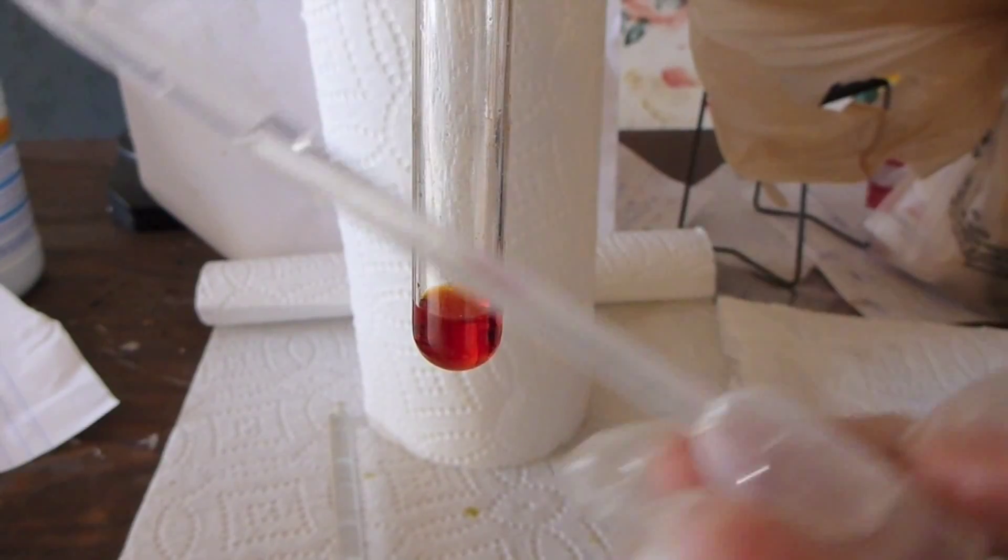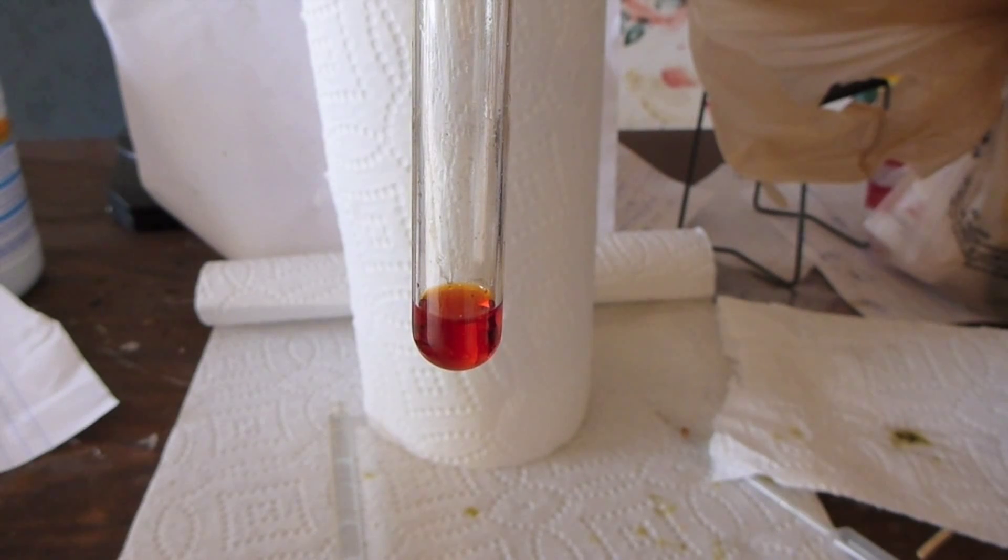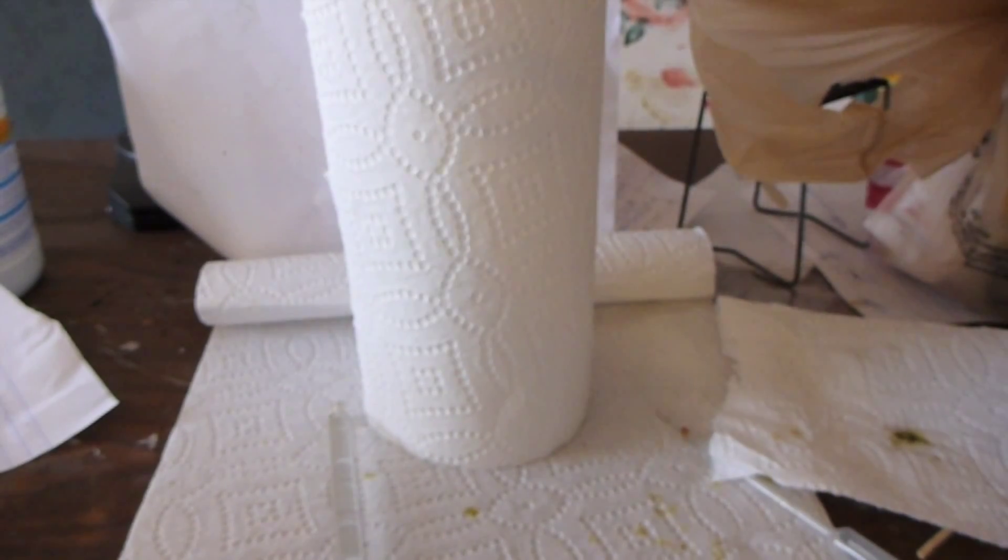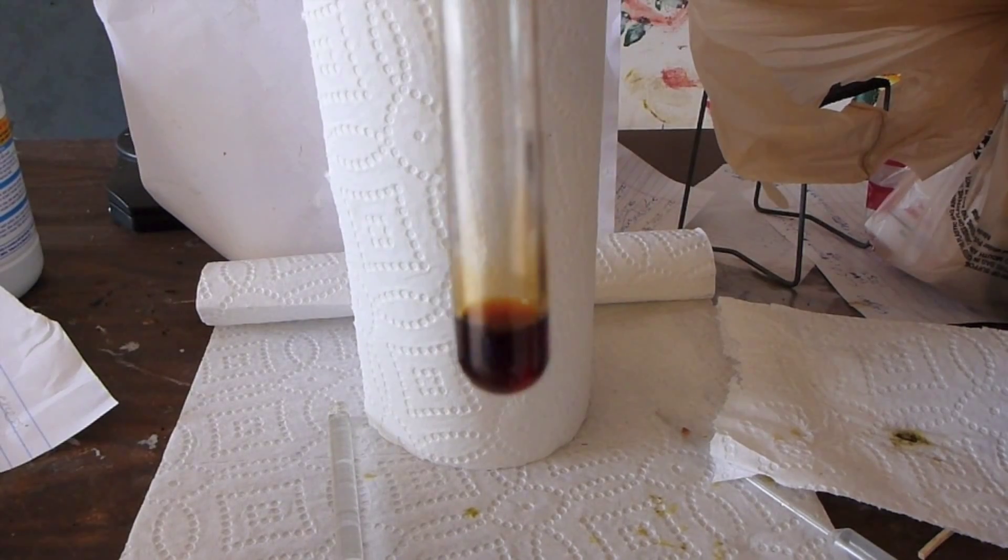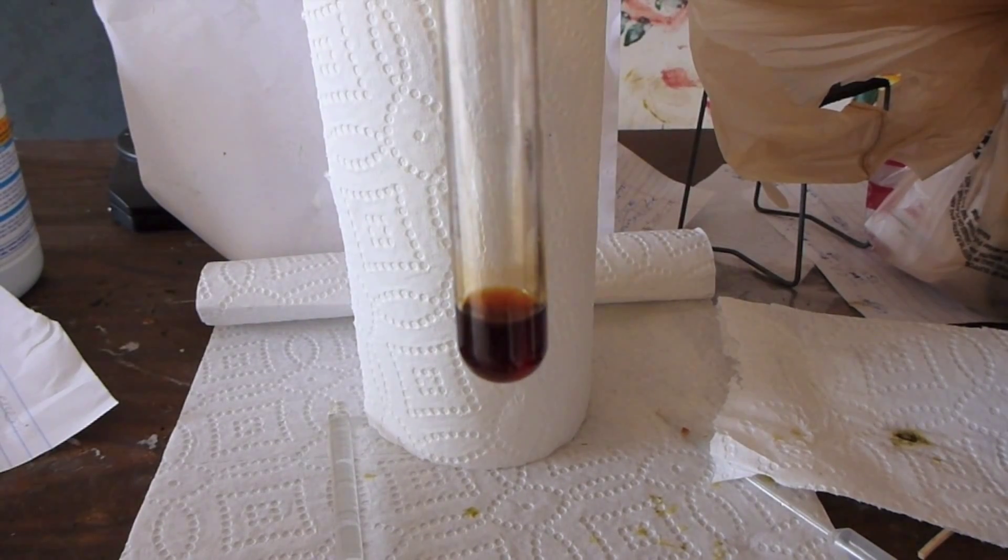All right, so here's my ruthenate starting solution. And this time, what I'm going to do is I'm going to acidify the solution. Now, the first bit of acid reacts with the hydroxide and just neutralizes the solution, and then it starts to get acidic. When it gets acidic, the ruthenate disproportionates into perruthenate and a ruthenium chloride complex, which features ruthenium in the formal oxidation state of 4 plus.